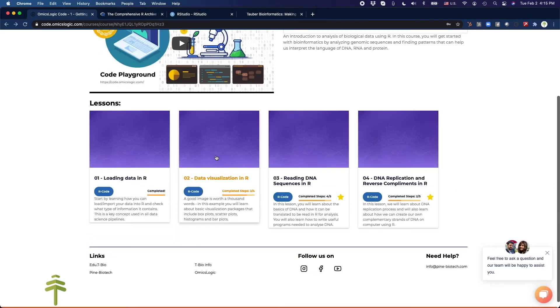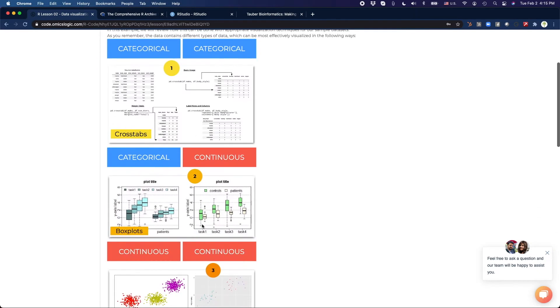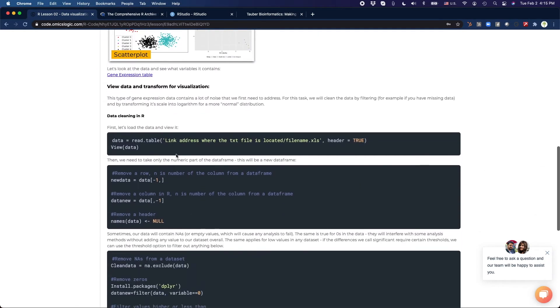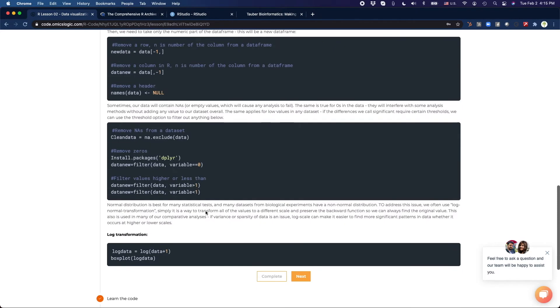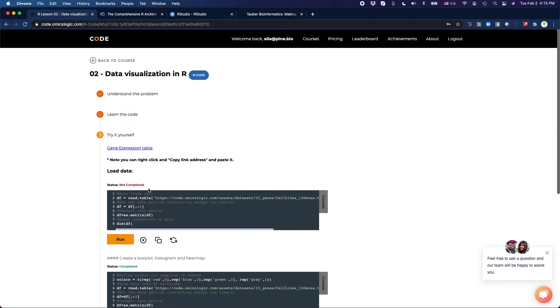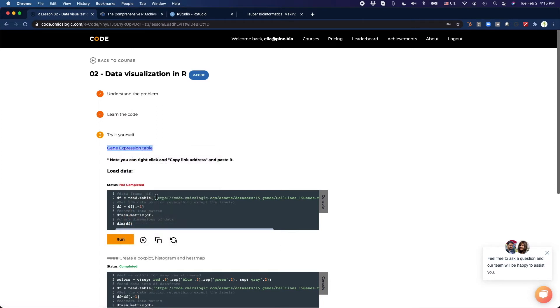Now we can visualize this data. Let's try to visualize. Now there's many different types of data: categorical, continuous. So let's read about how to work with such data. Let's try it yourself. So here we're working with a gene expression table. We can replace this link again.